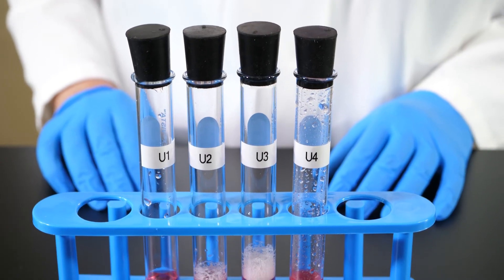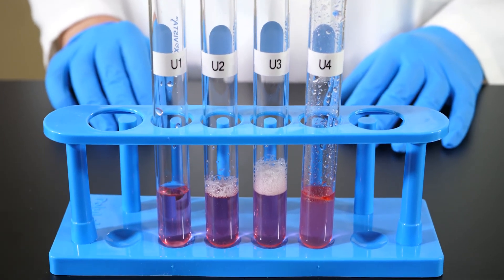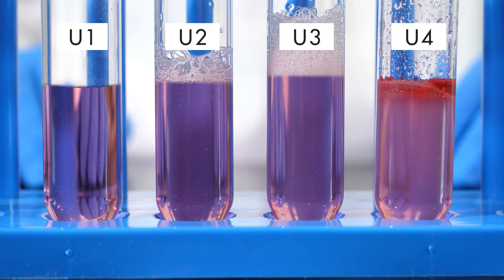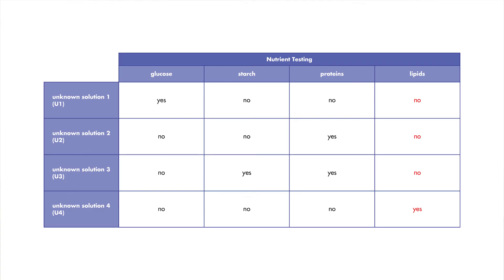After waiting approximately 5 minutes, we examine the results. The sample containing unknown solution 4 has separated into a dark red layer above a lighter red layer, which means lipids are present in unknown solution 4. Since none of the other unknown solutions separated into layers, we know that lipids are not present in those solutions. Record your observations in your lab journal.